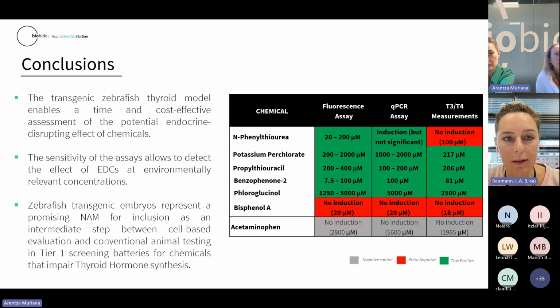Yes, we have an internal software that can detect the intensity density of each picture and relate it to the thyroid part of the image, because sometimes you can have some external fluorescence or background in the pictures, but we delete all that and take only the ones that belong to the thyroid gland.